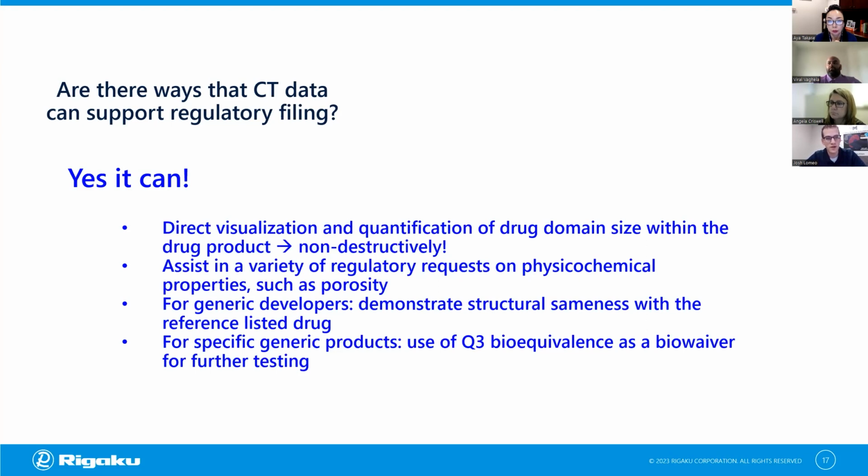So this will be a way where we can track what has been done with data, who has done the analysis, and when they did that analysis, tracking everything for the original CT data, as well as any derived data sets that might have been extracted during the analysis. Yes, you guys have an excellent tool with your I2S system there. I imagine they want to see exactly what happened, when it happened, and the result of it. So it's key to have all that.